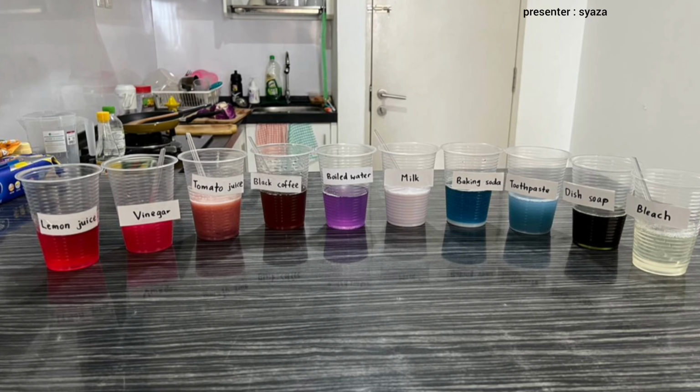Based on the observation of color changes after adding the red cabbage indicator, we can differentiate the difference in pH value. For example, a substance tested which is lemon juice, after adding together with the red cabbage indicator will change the color of the red cabbage indicator from purple to red as it is considered the most acidic substance. Unlike other substances tested like milk will have a slightly different color than lemon juice as the amount of acidity of the substance is not as high as the amount of acidity that can be found in the lemon juice.